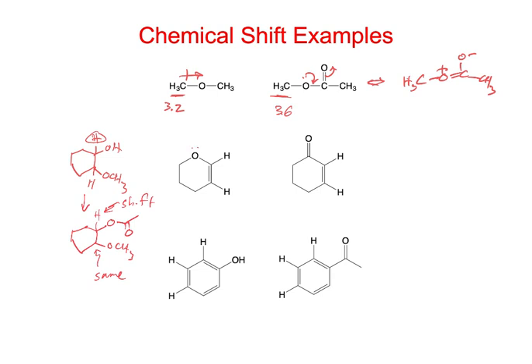If we have an ether like this, an enol ether, then the one that is alpha to it is more downfield because of some inductive effect. The beta one is shifted upfield because of resonance. Okay? If we have a carbonyl, it's the opposite situation, right?